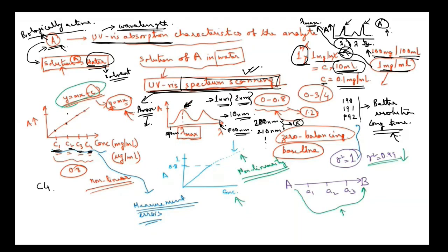Then I have to fit a curve of y equals mx plus c. Okay, so there will be a straight line which will be passing through all the points. You will be getting an equation for this, and this equation is called the model equation. However, while we are modeling the system, we need to take care that this c should be 0. Okay, the constant should be 0. That means this model straight line should pass through 0.